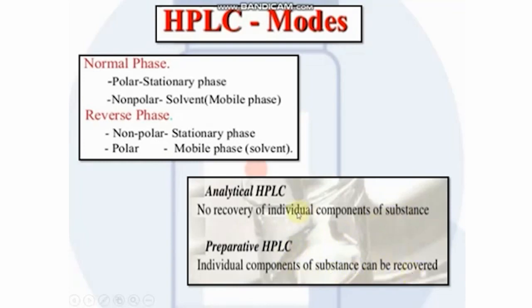So in analytical HPLC, we can determine the number of components or molecules present in the mixture.